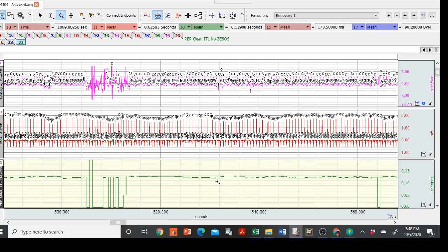This participant, let's see if I can eyeball it, looks like they're about 0.125. That seems to be their average for this little data series. Different participants have different norms. I've had some that I've worked on that are like 0.15. Some are 0.125, some are 0.11. It depends on the participant, but you'll get a sense with each one what their average running baseline is.